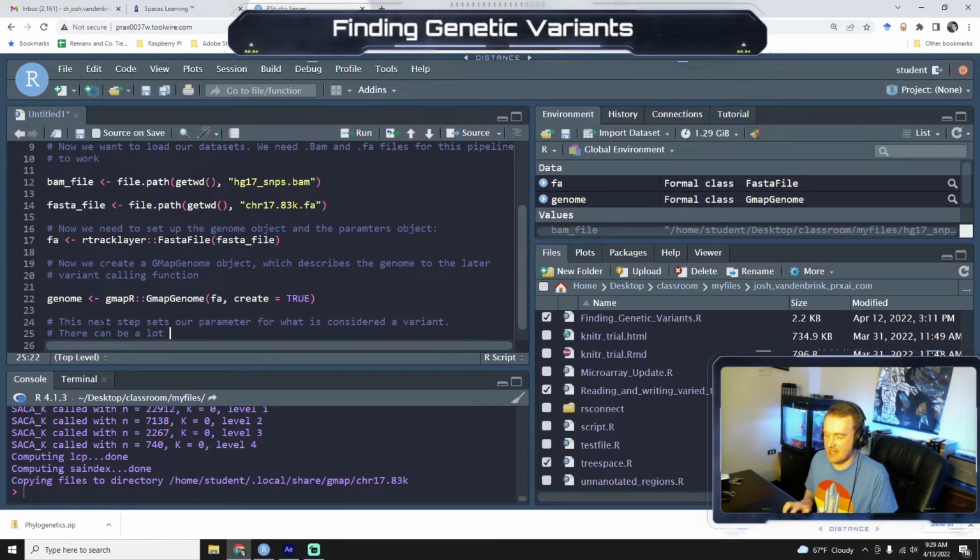There can be a lot of fine tuning to this function.